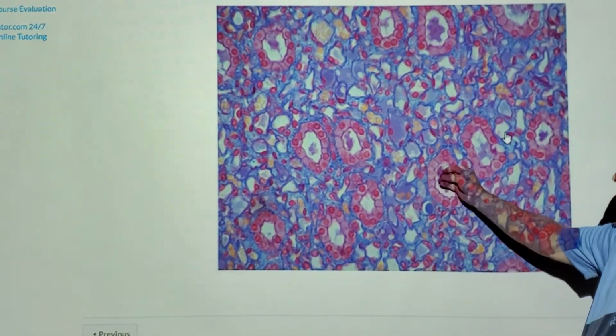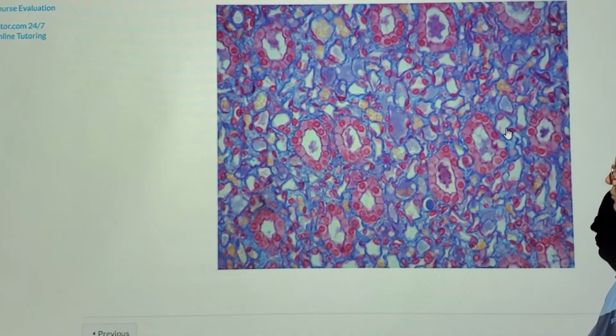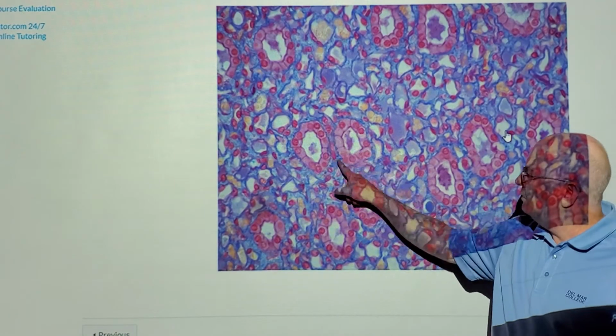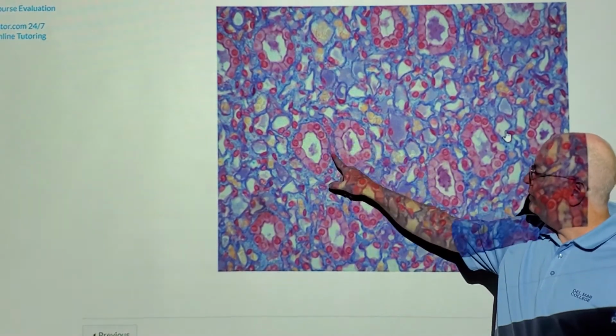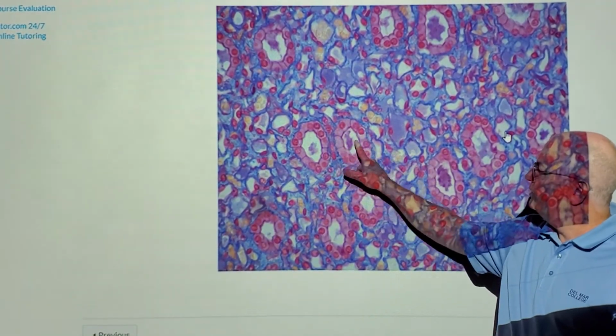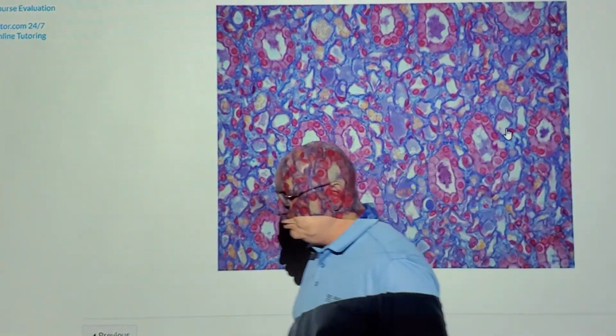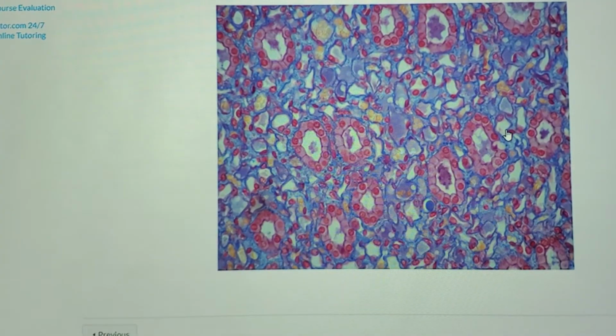And this is a secretion that's going to be leaving through the kidney tubules, or some fluid flowing through the kidney tubules. But every one of these rings of cells has a basement membrane around it, a layer of cuboidal cells, and then the outside world. Okay? That's simple cuboidal epithelium and the basement membrane.